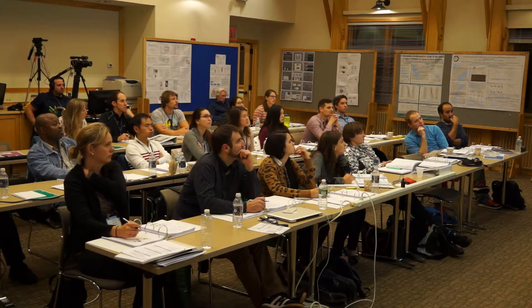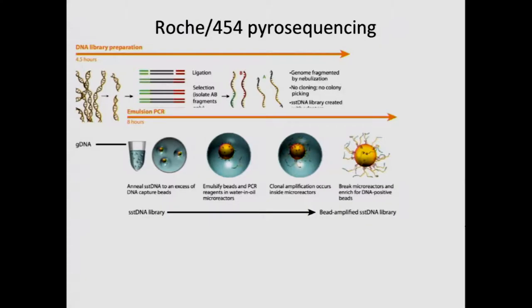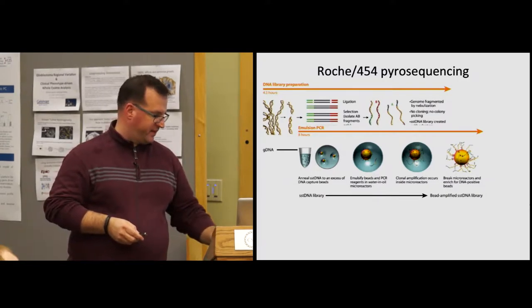Once in a while, there can be two fragments, and then you're going to have a polyclonal bead, and that's going to be a problem. The other problem I already alluded to is that lots of times you get no DNA in the bead, and so that's essentially a wasted bead. The last step there is to then essentially break the emulsion and do some sort of selection based on that other sticky end to get those beads that are actually DNA positive. But like every purification step, every selection step, there's some false positive and false negative rate for that.